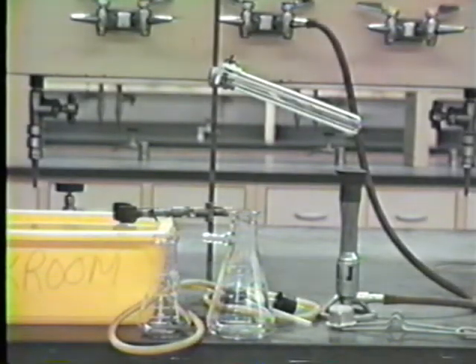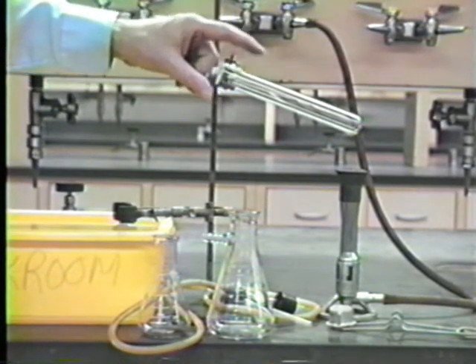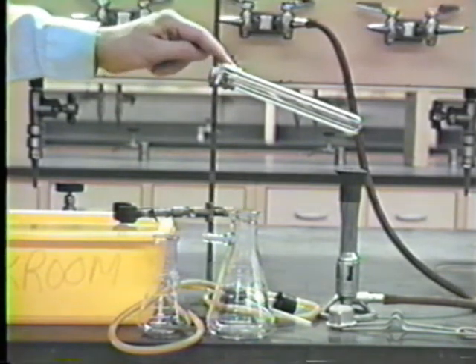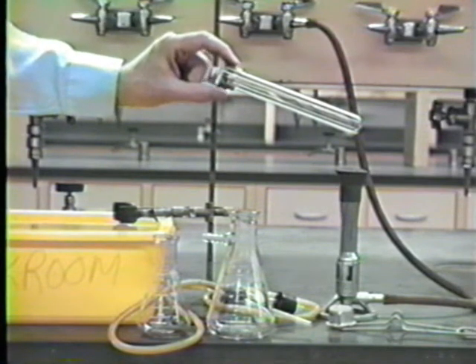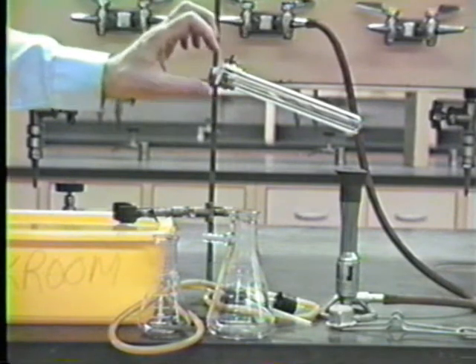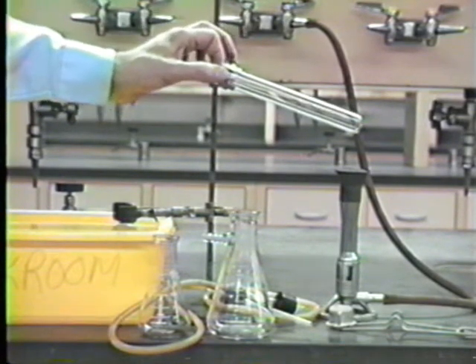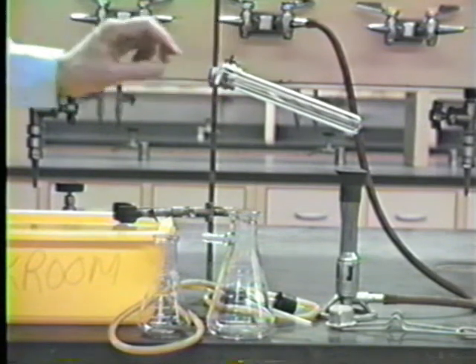Here's the apparatus that you're going to be using today. You will get from the stockroom these 2 test tubes, there's one of them here, and you'll clamp it in place. Now when you clamp it in place here, make sure that the clamp you have does not have rubber pads on it, because when you heat the tube, if the rubber should melt, it'll change the weight of the test tube and therefore give you bad results as far as the weight of oxygen generated is concerned.